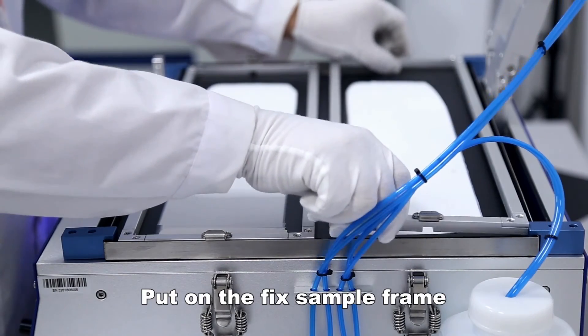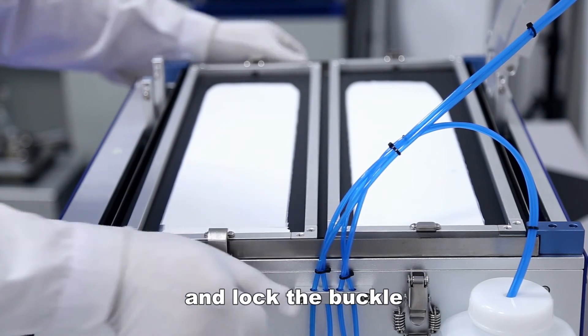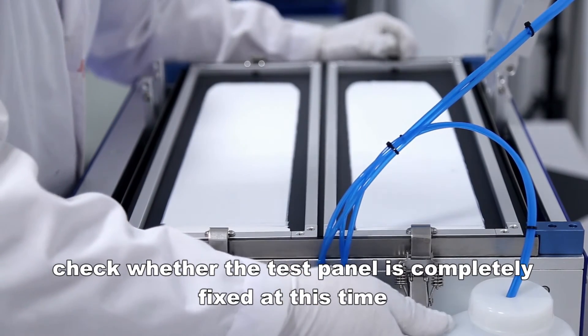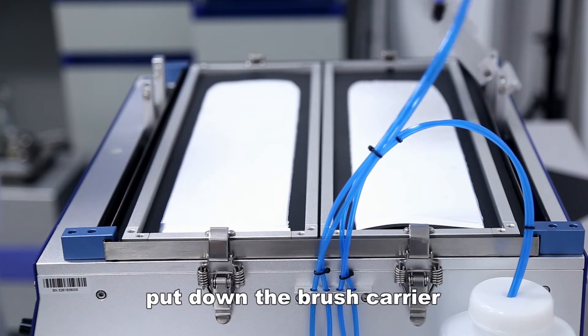Put on the fixed sample frame and lock the buckle. Check whether the test panel is completely fixed. Then put down the brush carrier.